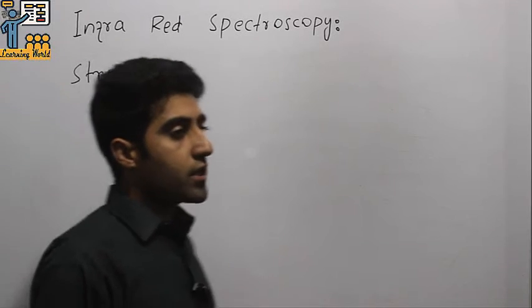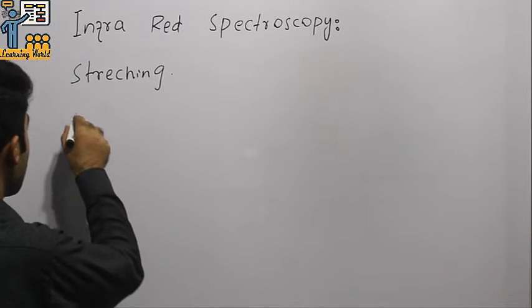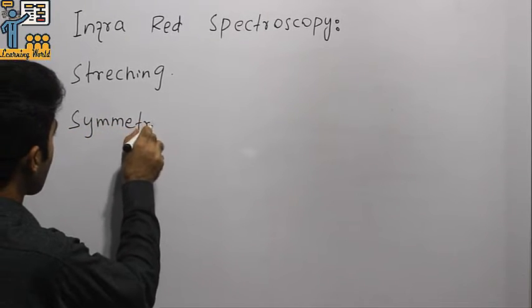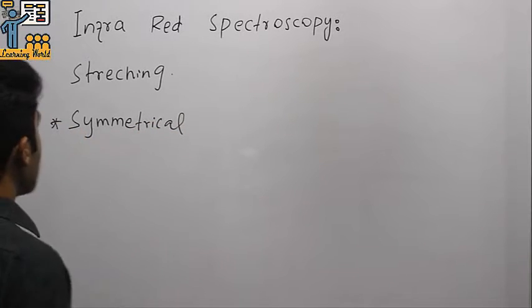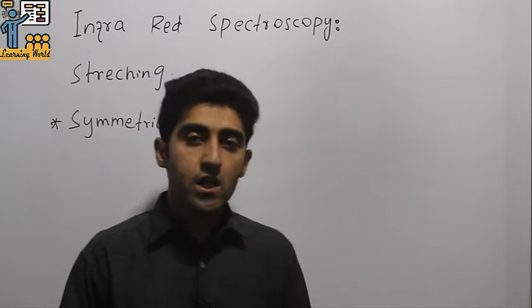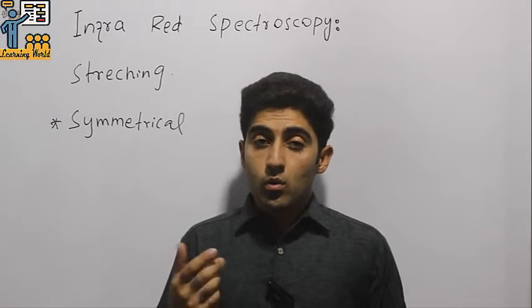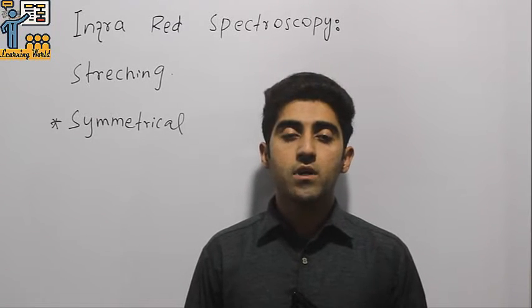Stretching is further divided into symmetrical and asymmetrical stretching. In symmetrical stretching, the interatomic bond between two atoms will be increased or decreased at the same time.